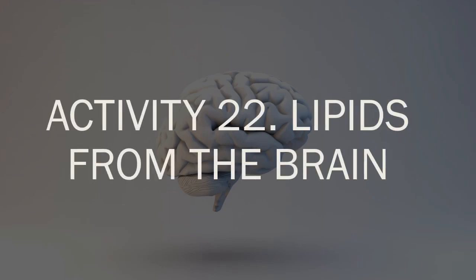And so again, we're back with your activity 22. That is your lipids from the brain. The lipid constituents of the brain are your phospholipids, your glycolipids, together with your sphingolipids and small amounts of triglyceride.